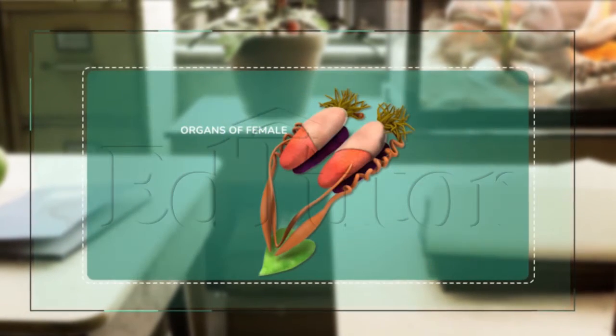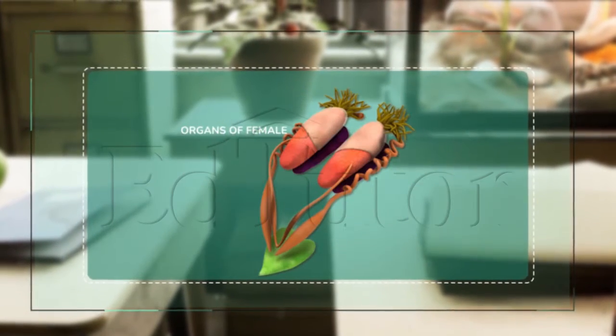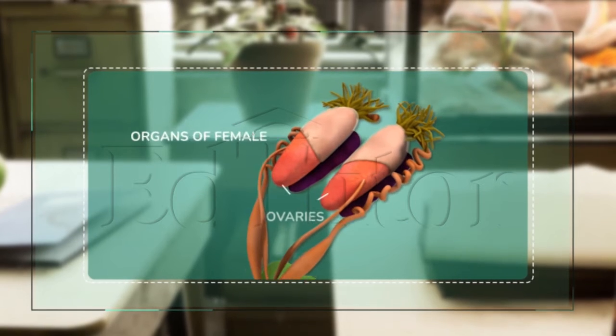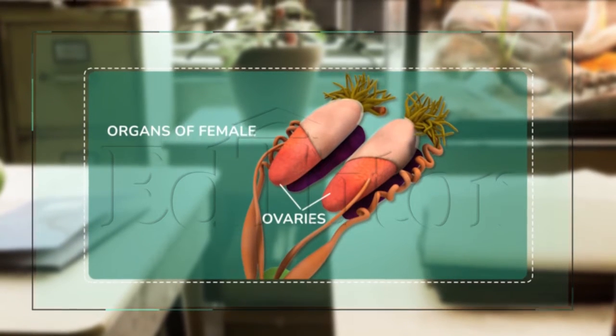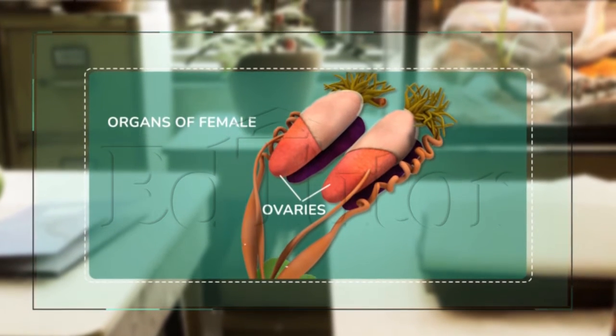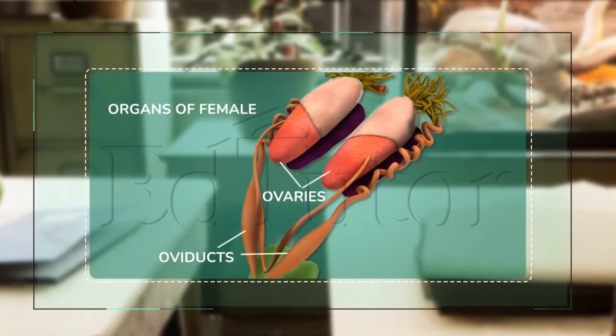And in case of a female, we see ovaries, oviducts, and uteri.